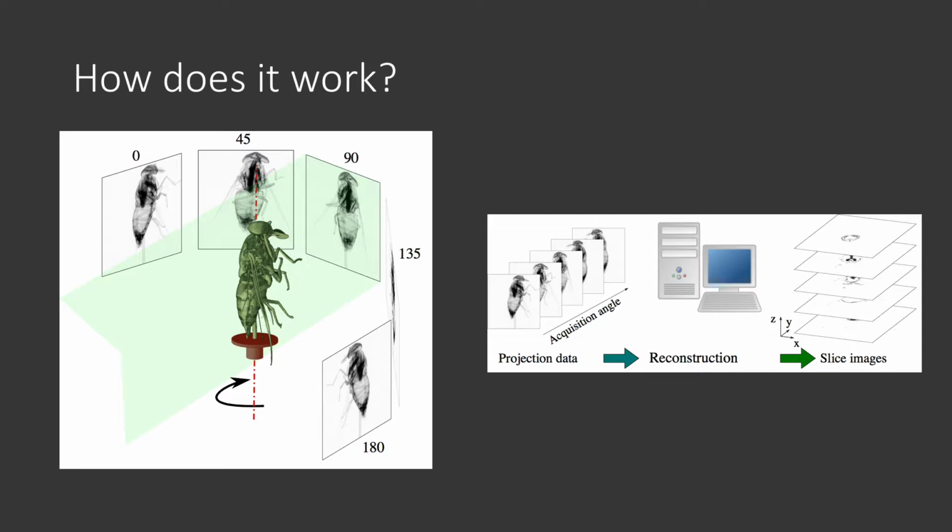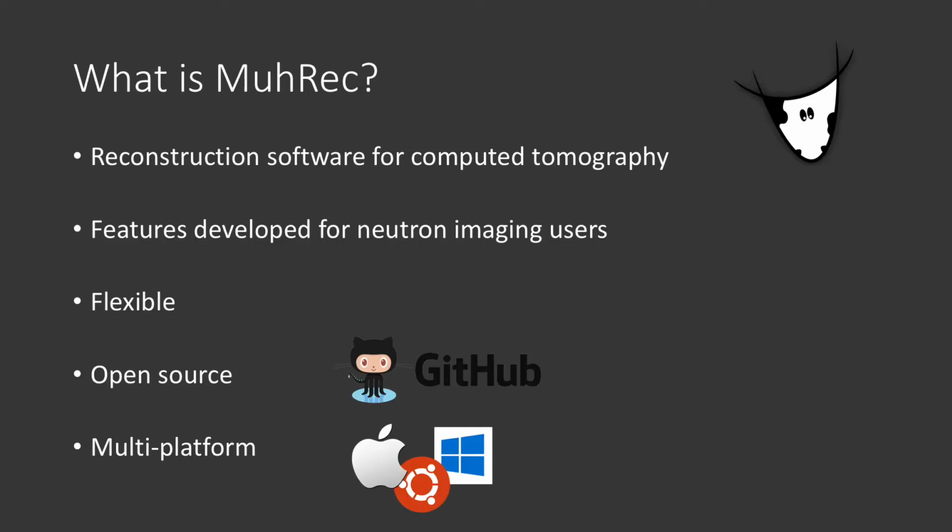Computed tomography is done in two steps. First, you have to obtain many radiographs from different sides of the sample. These radiographs don't show this 3D volume yet, but after the second step, which transforms the object into a volume, you can start looking into the 3D information.